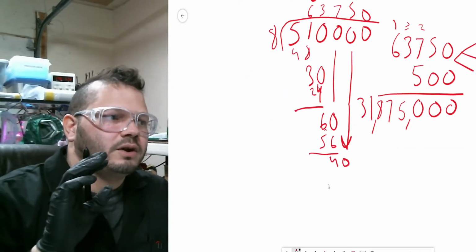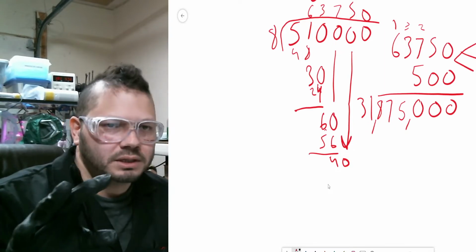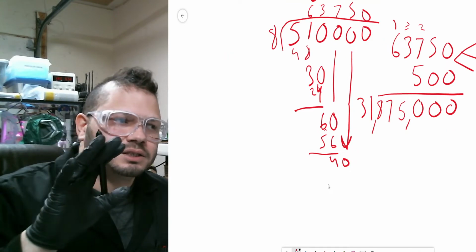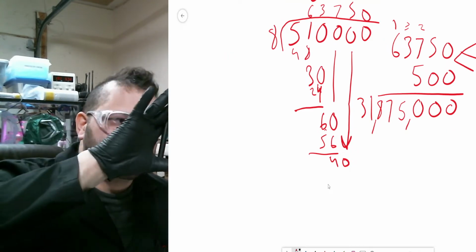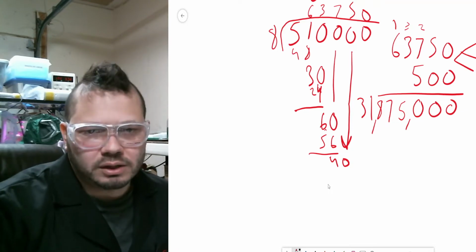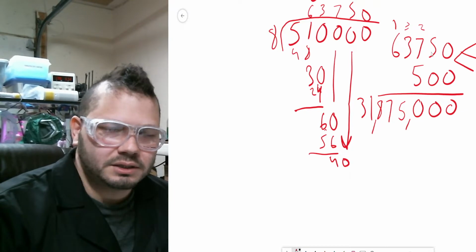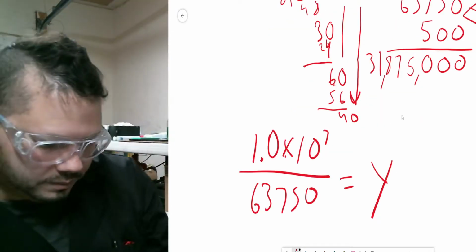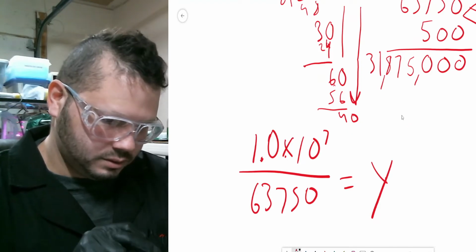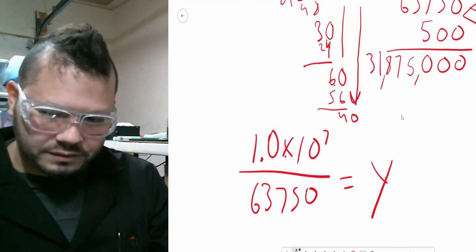Now, in order to figure out how many milliliters of this solution I need to transfer 10 million trichomes, I essentially have to take the trichomes per milliliter number. I take 10 million divided by that number. Now, luckily, this right here is the trichomes per milliliter, so I can simply use this number right here. So I need to transfer 157 milliliters of the solution.